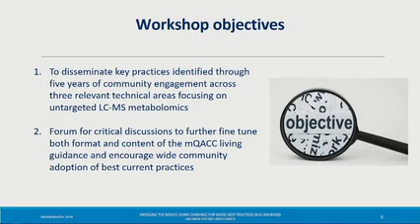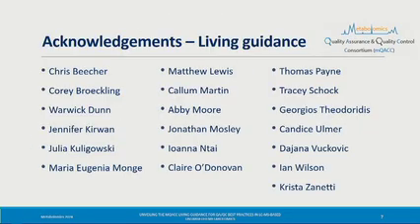So the objectives of the workshop today are to disseminate key practices identified through 5 years of community engagement across 3 relevant technical areas, focusing on untargeted LC-MS metabolomics. We also have a forum for critical discussions to further fine-tune both format and content of the mQACC living guidance and encourage wide community adoption of best current practices. So these are the working groups. This is the group effort that they worked out for this living guidance.